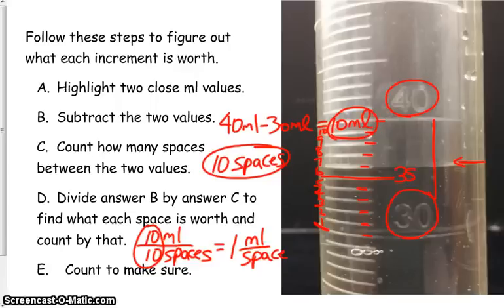So if we count, we have 30, 31, 32, 33, 34, 35, 36. So our water level is 36 milliliters.